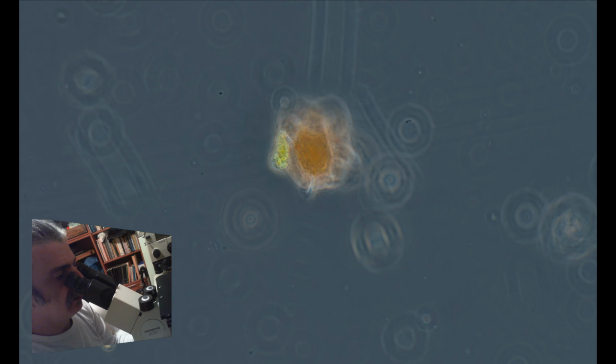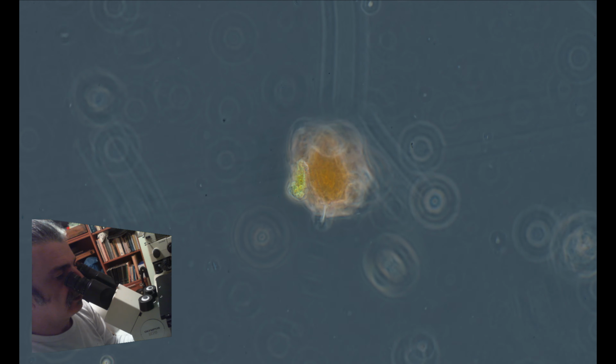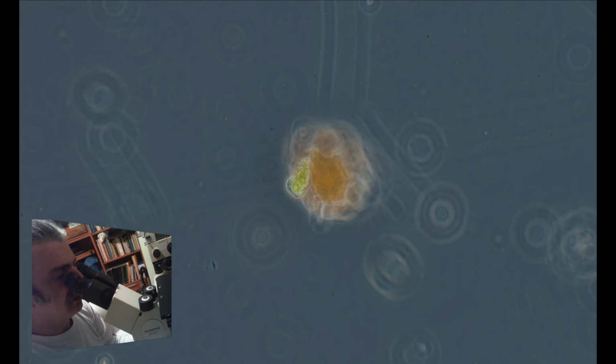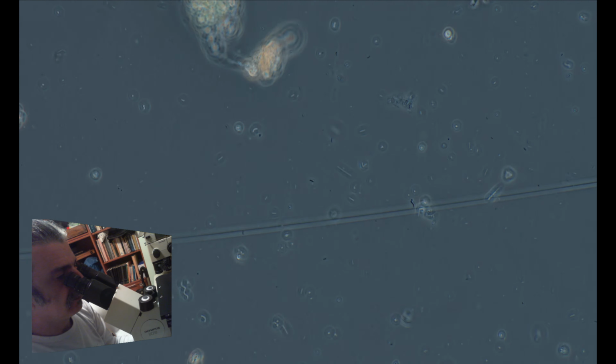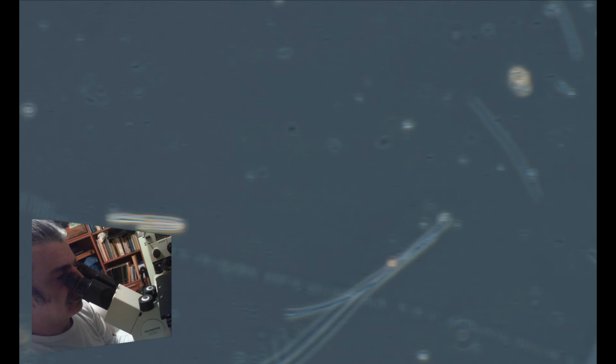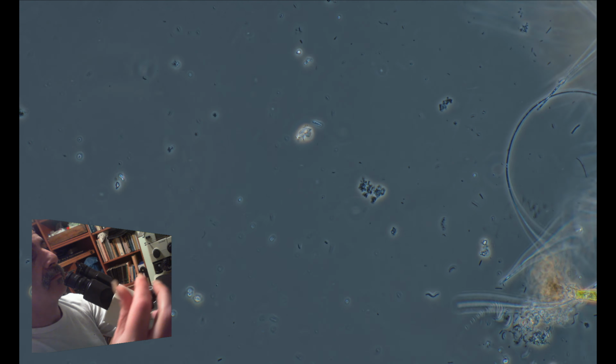And it surely caught something. It's in the middle of digestion, I think, some kind of algae, but I can't be sure who exactly. Okay, back to 10.